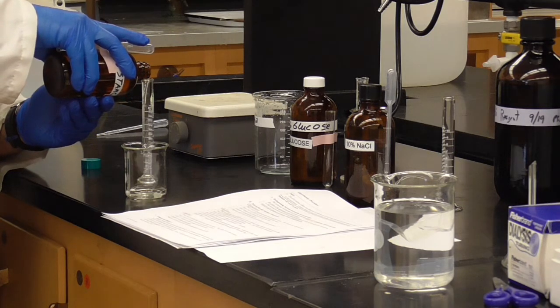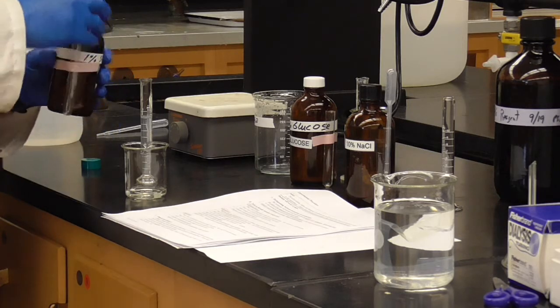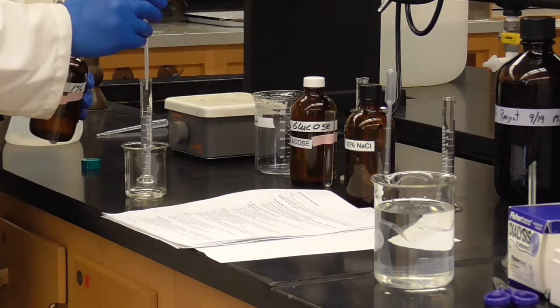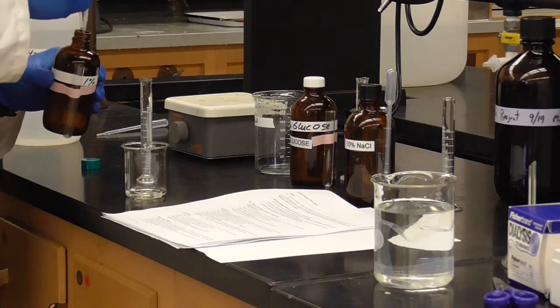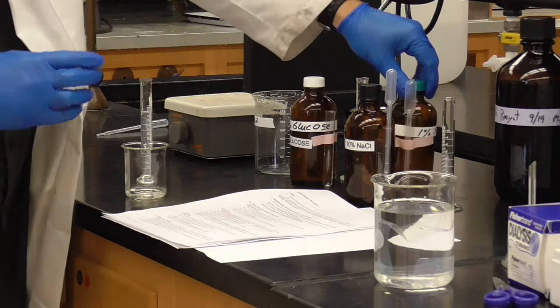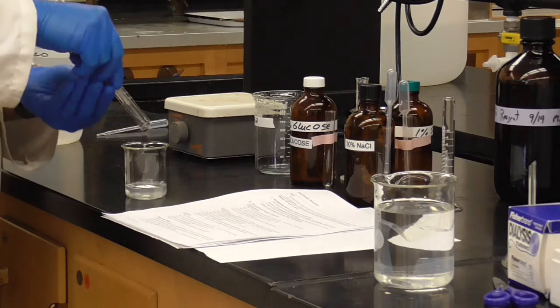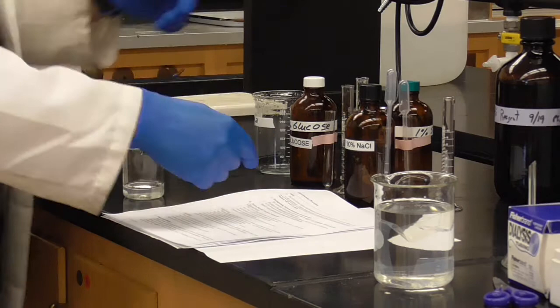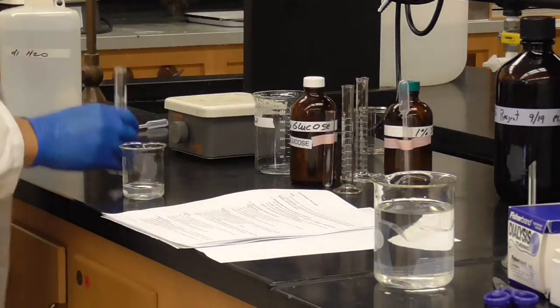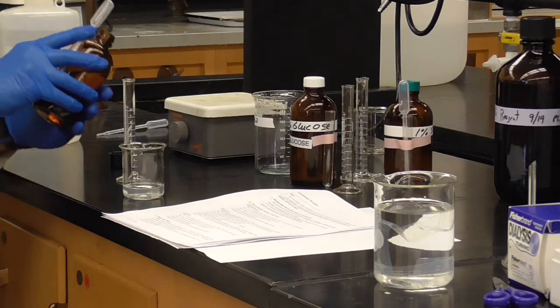About 10 milliliters here. A little bit more. Use the stopper. That's pretty good. Put that in. And finally, the salt sodium chloride solution, so we can get our chloride ions in there as well.